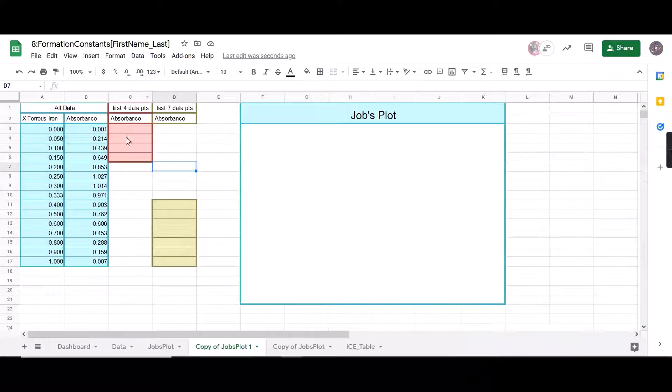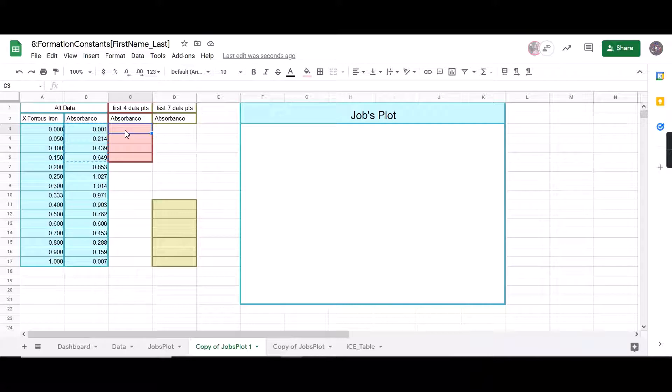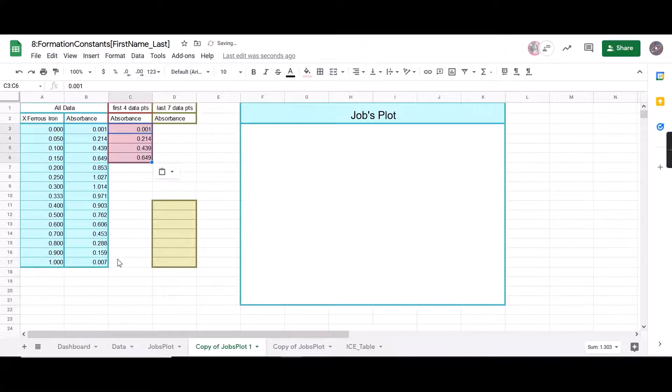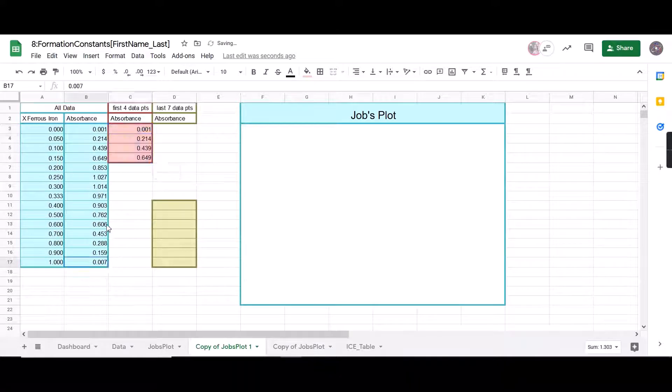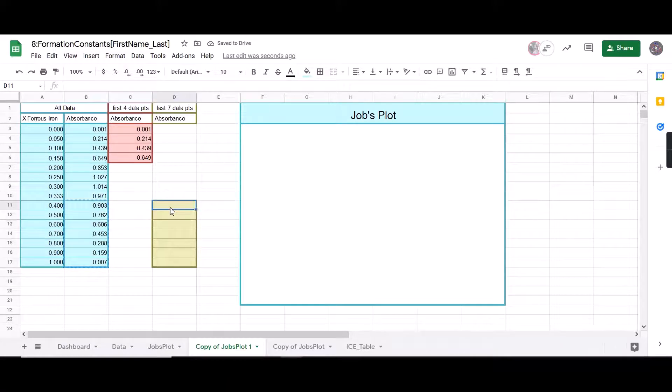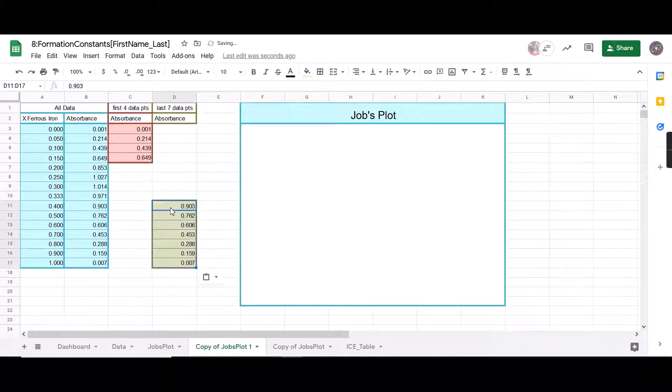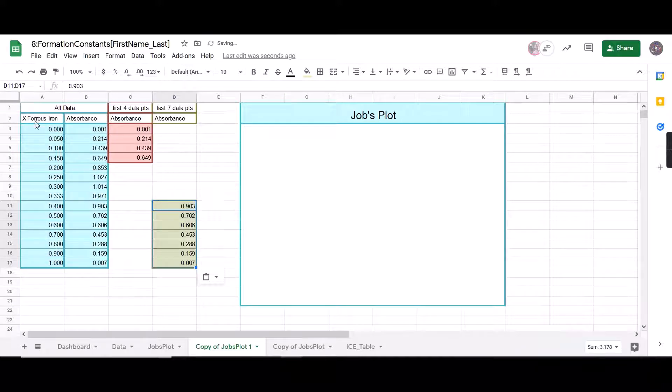Next what I want to do is I want to copy over my first four data points for the absorbance. So I'm going to highlight the first four, press Control+C, and once again doing Control+Shift+V. Remember that's Control+Shift+V, not just Control+V. That will paste the formatting too. We just want the numbers.